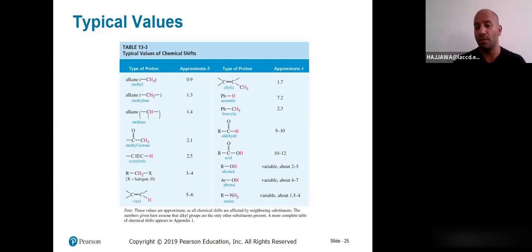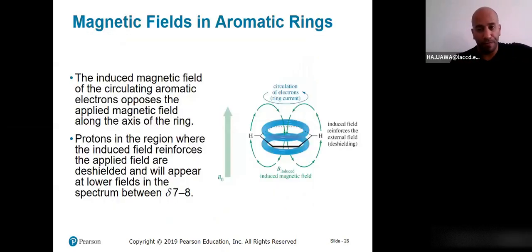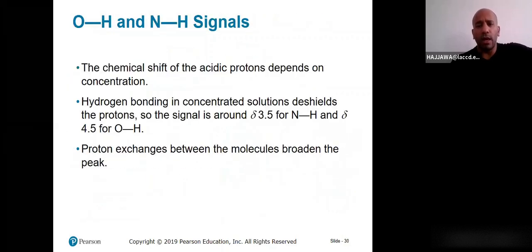Once again, it will be useless to just look at the table and try to memorize it. What you are advised to do is look at a lot of examples. You're going to build up trends, and the fact that you're going to see a certain moiety around a certain area every single time is going to make you remember. If you see it in a certain spectrum, you will know right away what that moiety or peak corresponds to, and so on. So let's start taking examples.